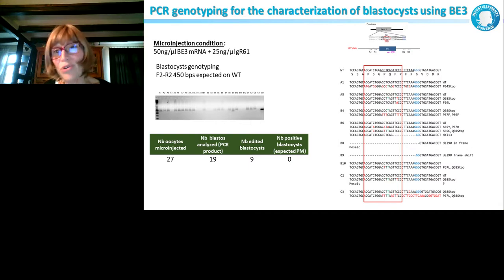But even more than that, the conclusion for this experiment is that in mouse, even if it works, it is not great. When we sequence, we could see the expected conversion, C to T, but we could also observe C to A and C to G conversions in most of the mutant blastocysts. We could observe deletions and insertions also in some blastocysts. That's no good. The editing window is much, much larger than what is presented at first, which said it's not precise; here it's 10 base pairs. So to generate a specific mutation will be very difficult.